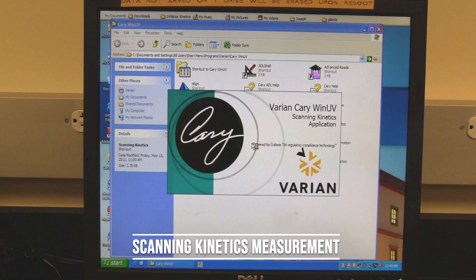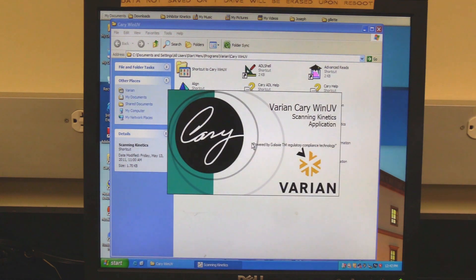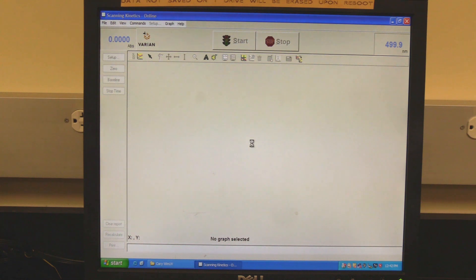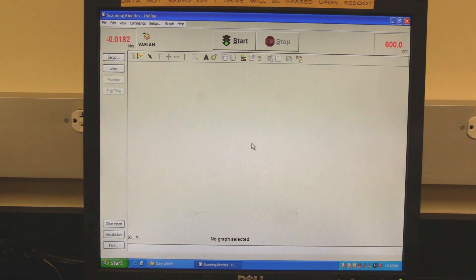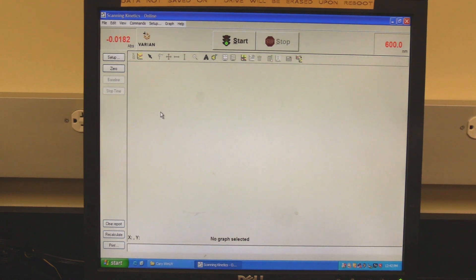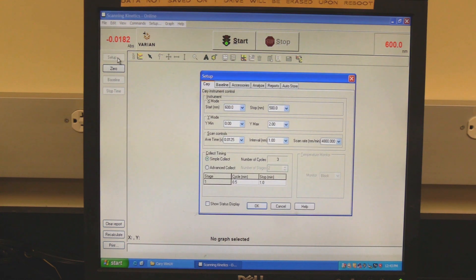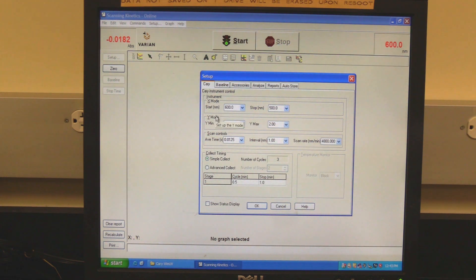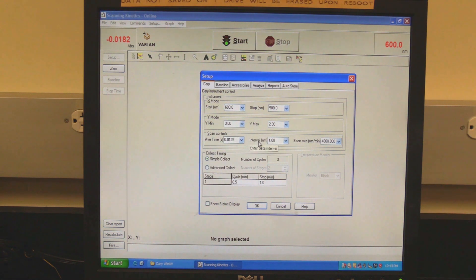Scanning kinetics measurement: in the Cary Win UV folder, double-click on the scanning kinetics icon. Wait for the software to open and initialize — the instrument will be finished initializing when the absorbance reading turns red. Click on Setup to set measurement parameters. Setup should open to the Cary tab. In the X mode section, set the scan range — Start is the higher wavelength, Stop is the lower wavelength. In scan control, set the scan speed by setting the average time and data interval; scan rate will automatically be calculated.